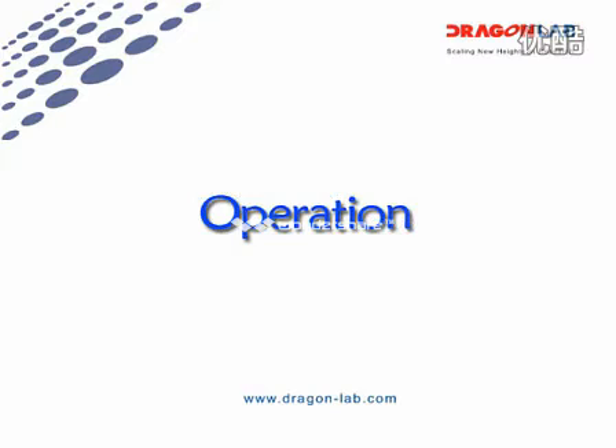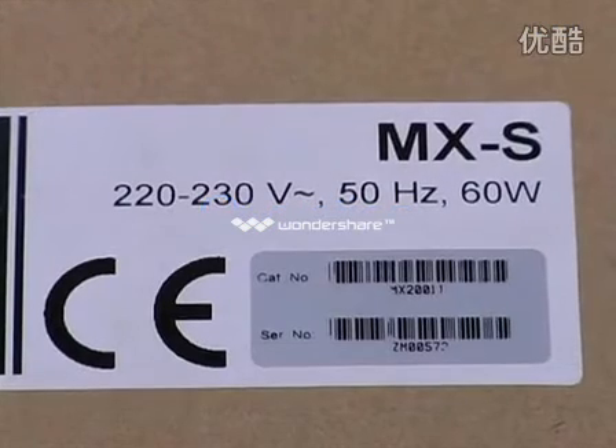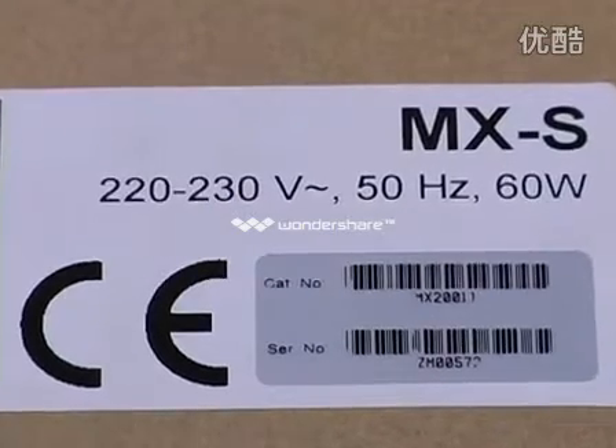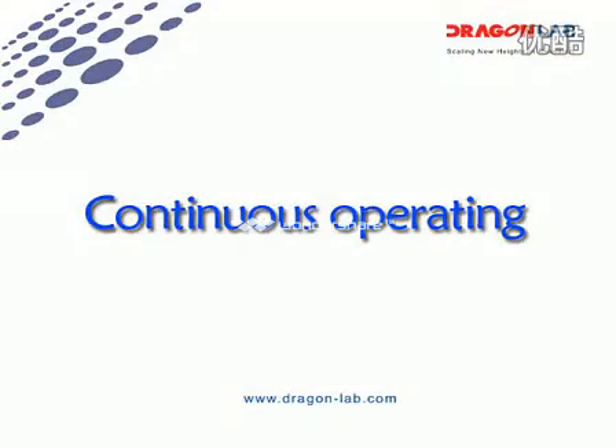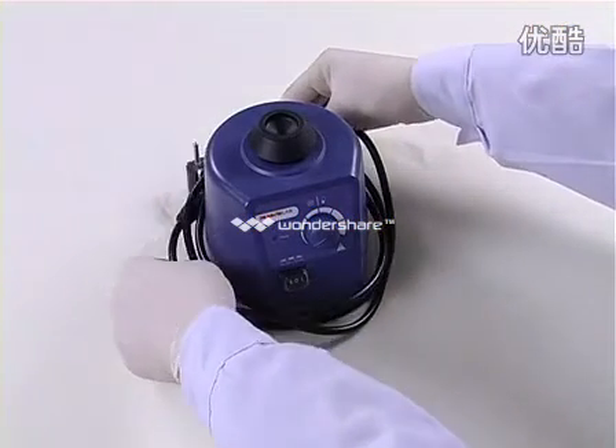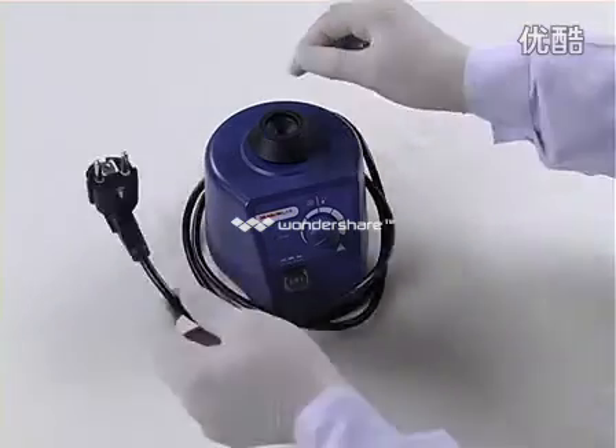Operation: Make sure the voltage and frequency are correct for your instrument. Ensure the instrument is placed in a safe and stable position, then plug in the power cord.